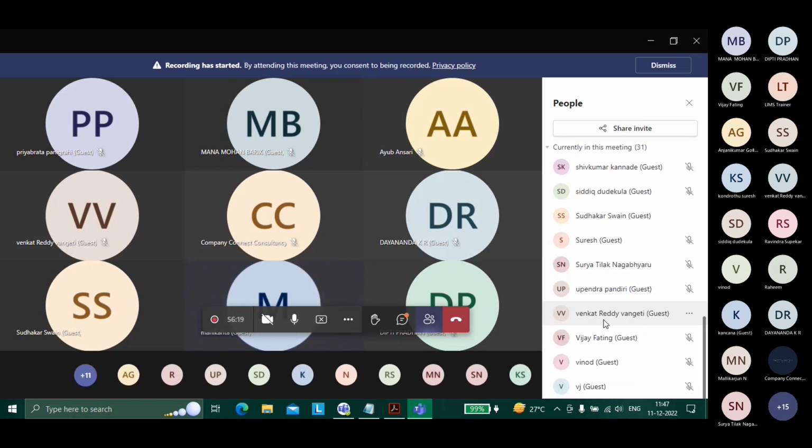Regarding the admin activities in Labware LIMS, is any special or particular language used, or what do they use? They don't use any language. See, admin activities basically means creating users and giving access to those users, right? Giving the roles. Mostly those things are in your users table only. There is one table. You go to that table and you create the users. You give the password. You give them the roles. You give them the functions.